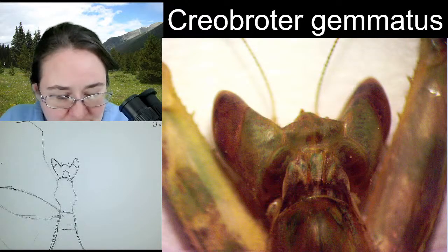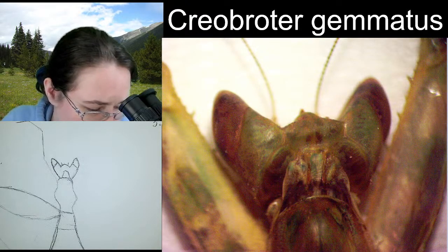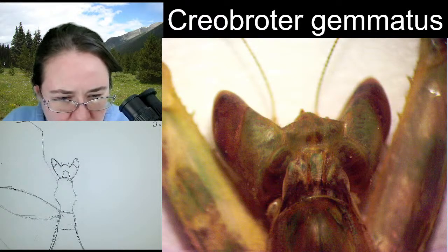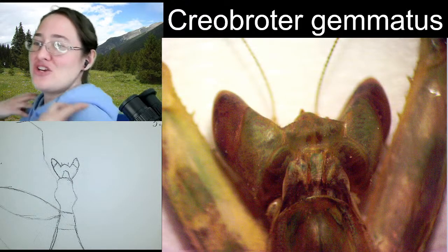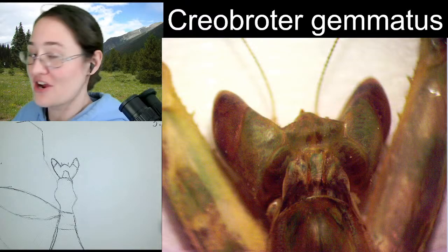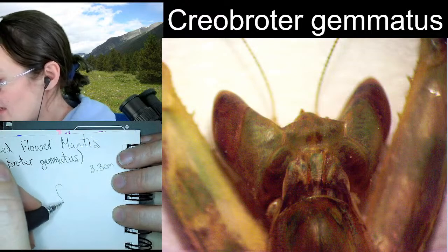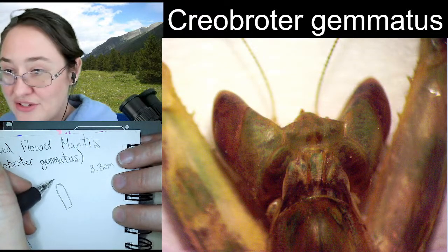If you view a mantis from the side, the second long leg segment comes up from the first, so that's how you can tell the second is the femur. If a praying mantis is sitting at rest, the coxa, the hip bone, is actually coming down. So that's that hip bone.